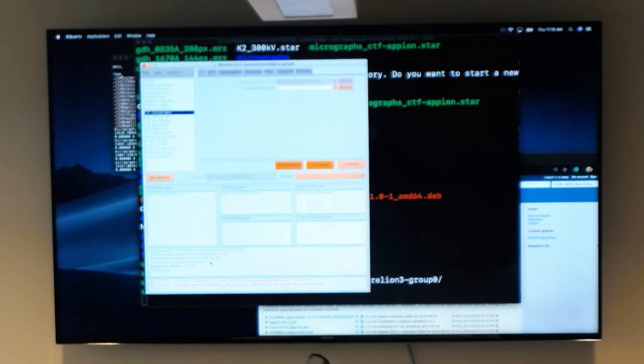So if I move, well, I don't know if that would work. Let's see if that works. Into micrographs. Now they're there. So now if I list that, they appear. It's actually existing. So Relion just didn't find them. So if we double click here, it didn't find any of these, which is fine. So then it just skipped it. So now if I continue, we'll see if it finds anything. Okay, it didn't find that.